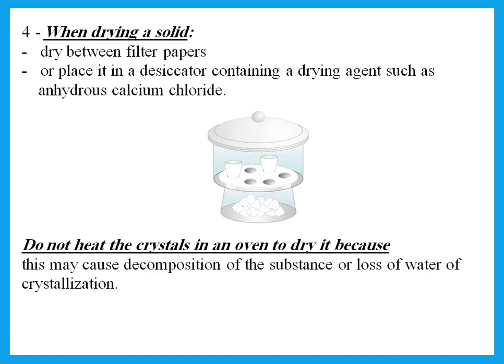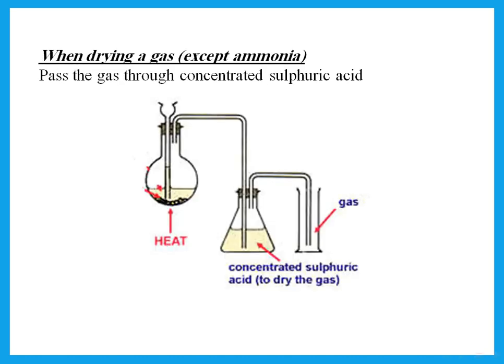Remember, we never say heat the crystals in an oven when we want to dry it because this would cause the decomposition of the substance, especially if I'm trying to prepare a hydrated salt. Remember, a hydrated salt means a solid that has water of crystallization in it. That means when it forms crystals, it takes water with the crystals. So if I put that in an oven, the crystals will decompose or I will lose the water of crystallization.